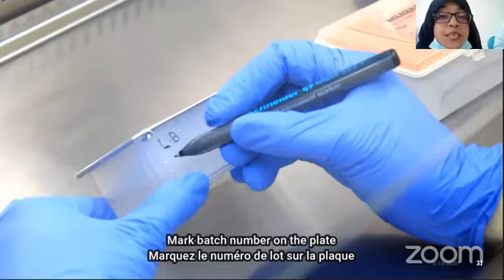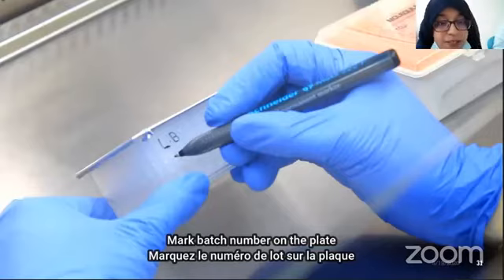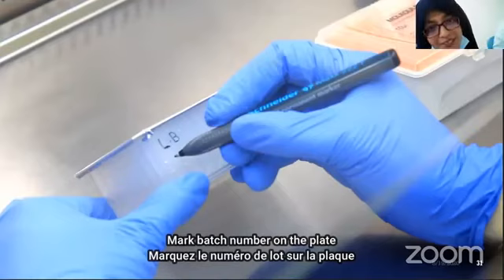Sometimes we run a sample on the automation, and after analyzing, the results are not clear. So we have to re-extract the RNA, and the sample volume is not enough. So we go for manual extraction because of the sample volume. In manual extraction, we use 140 microliter, and for automation, we use 300 microliter. So it depends upon the optimization, your setups, and the experience actually.